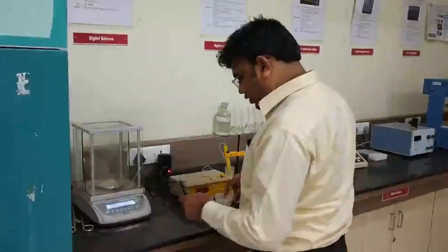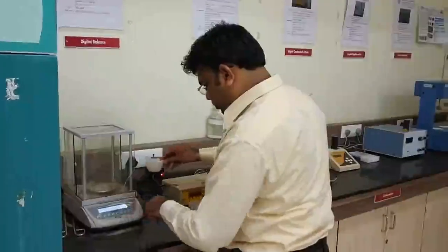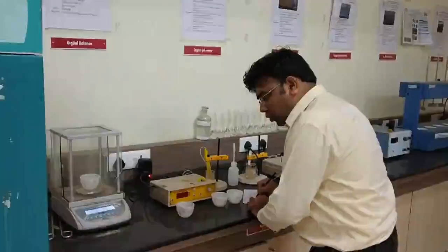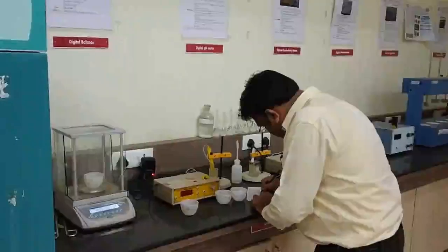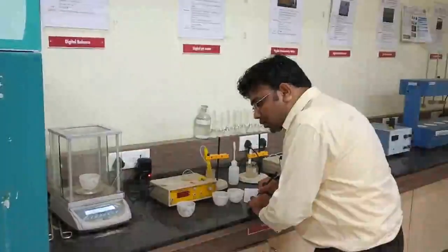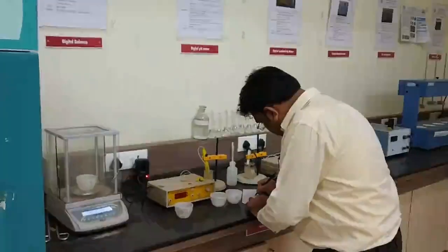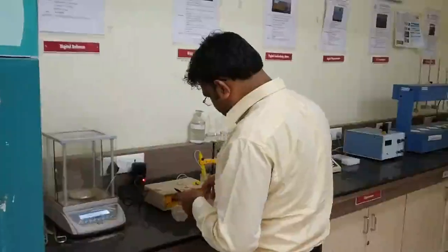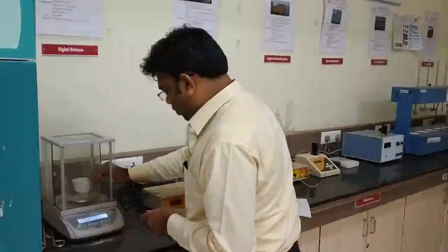Next, the empty weight of crucible B I am going to note down. In similar fashion, the empty weights of crucibles C and D will be noted.